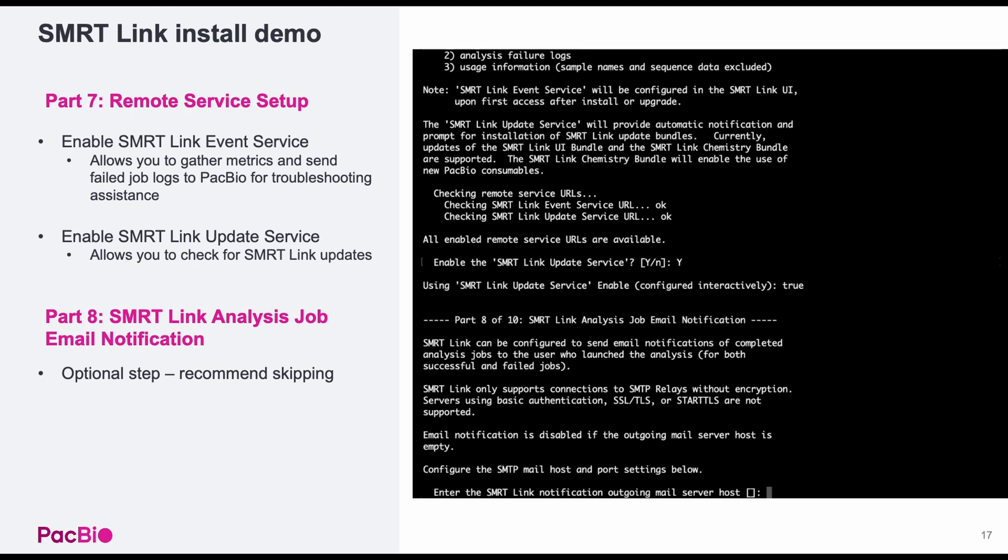Part seven sets up connection to PacBio remote event and update services to enable you to send PacBio SmartLink troubleshooting logs and smart analysis job logs. Part eight is for setting up SmartLink analysis job email notifications. This step is optional and can be skipped by pressing enter.